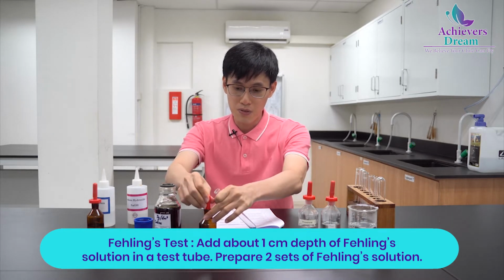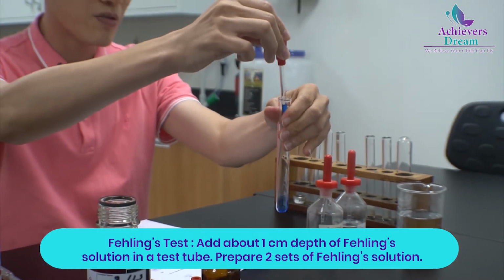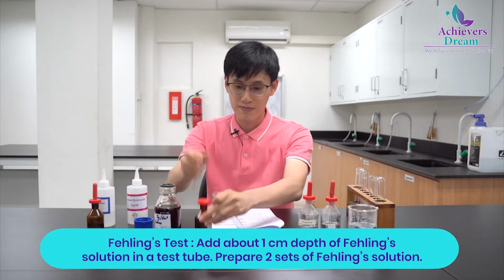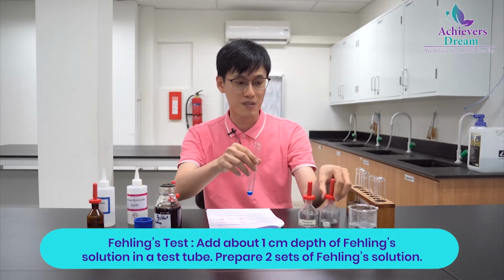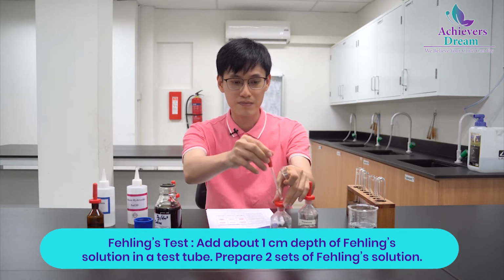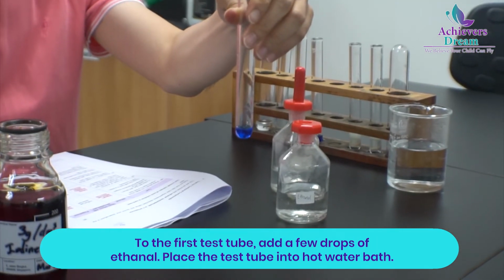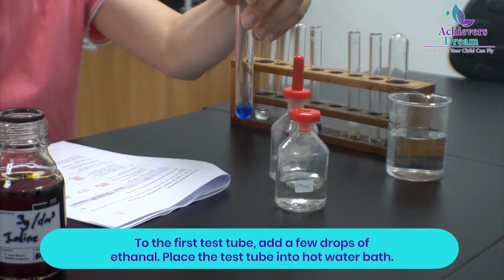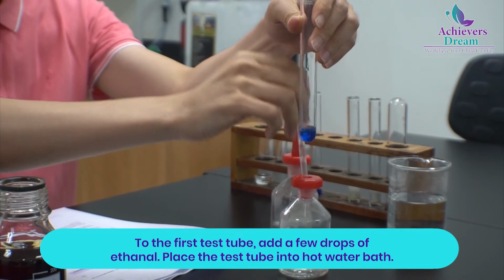So what we will do is add about 1 cm depth of Fehling's solution to a test tube, and we'll be adding our carbonyls in as well. So I'll be adding ethanal first. Ethanal is an aldehyde. Aldehydes can be oxidized. So when we add the carbonyl in, we expect to see a brick-red precipitate.